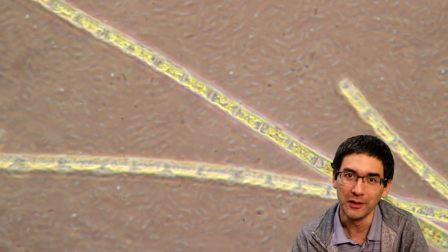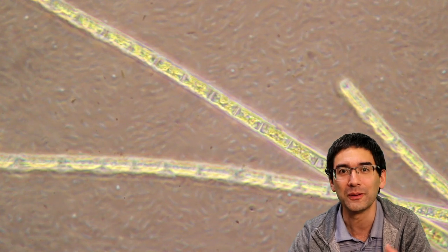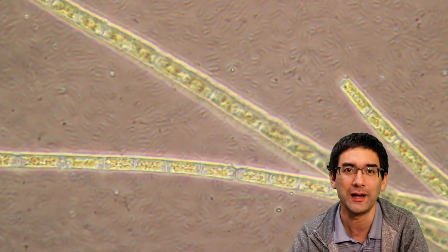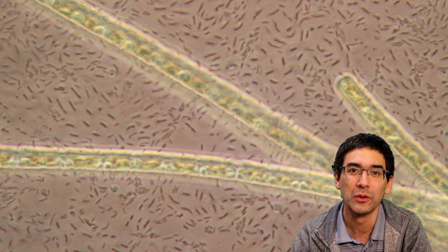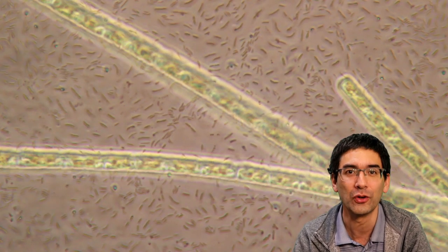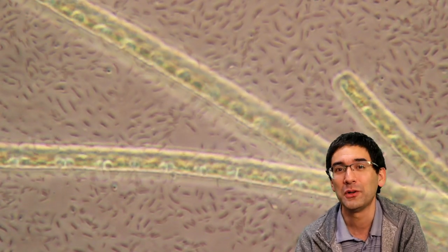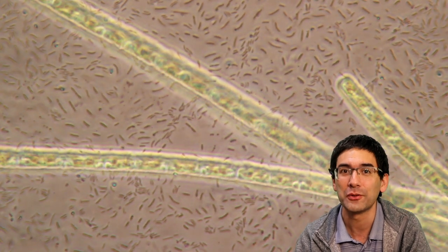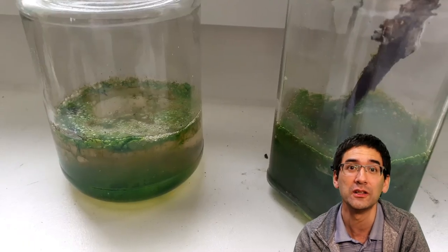What you're growing is a little bit of luck. It depends on the composition of organisms that you have. Sometimes you'll get different results even though you started off in a very similar way, because there are so many factors and parameters that influence everything.